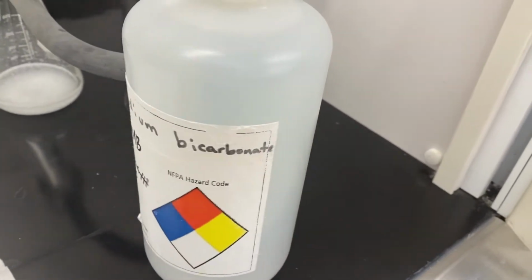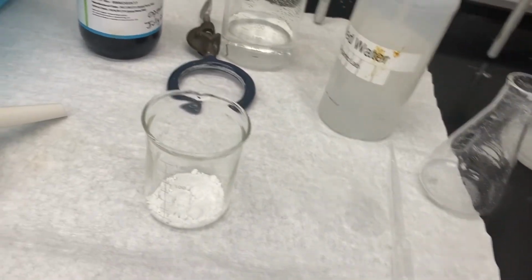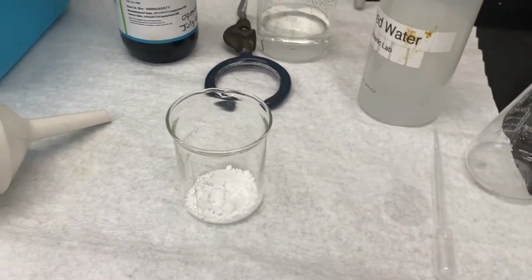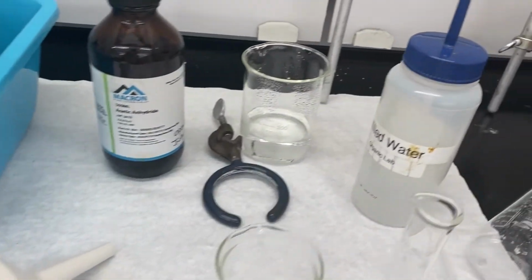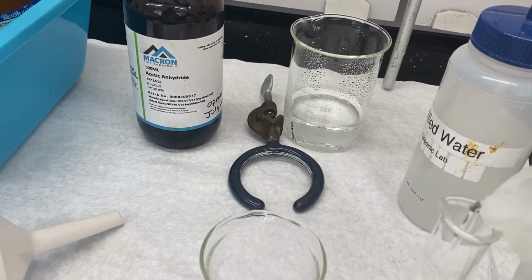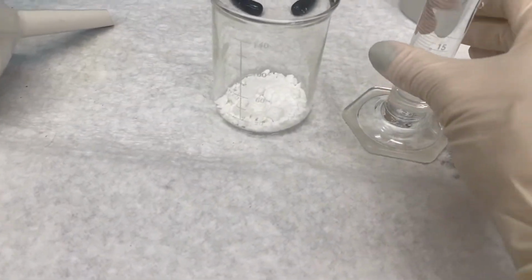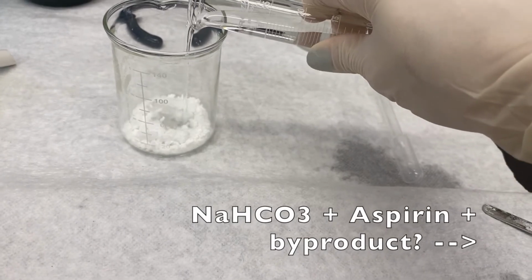And we're going to do that with some 5% sodium bicarbonate solution. It's a solution in water. So we're going to add about 25 milliliters of that into our beaker. And what you guys want to think about during this step is what are we separating or purifying our aspirin product from? Like what is it being separated away from, right? So let's see what happens when we add our bicarbonate.